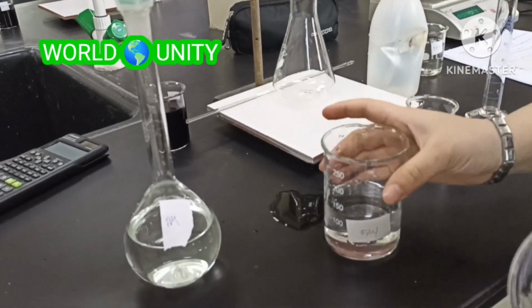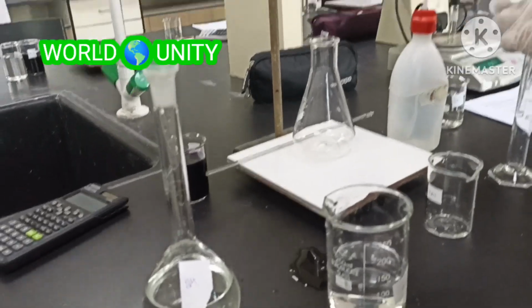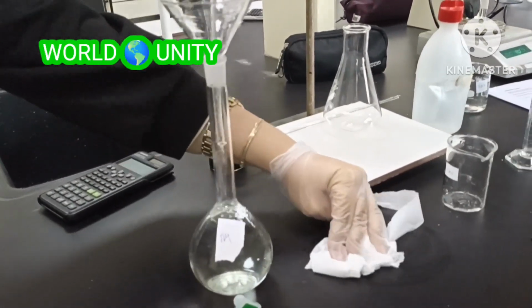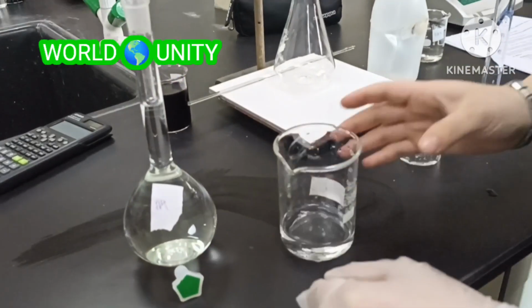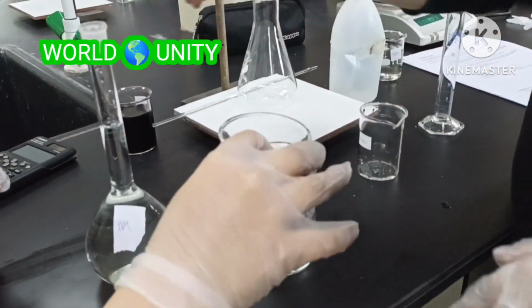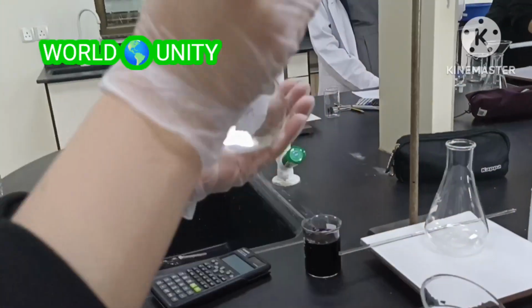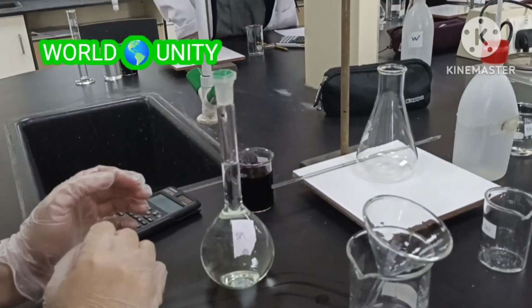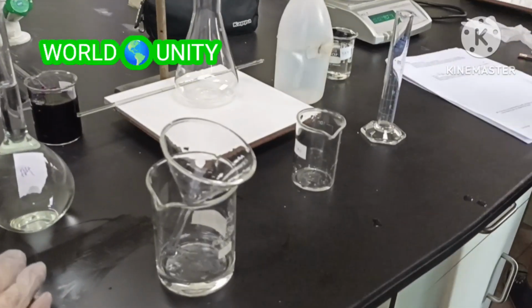Until how much? And then how do you mix? Three times. One, two, three. And the next, what do we do? The burette of A2. Okay, now it's for the titration. We're going to do this.